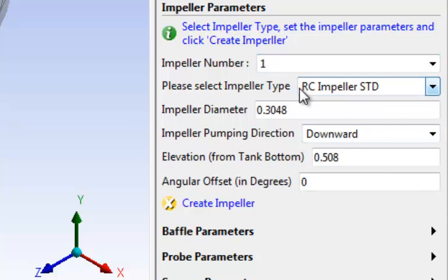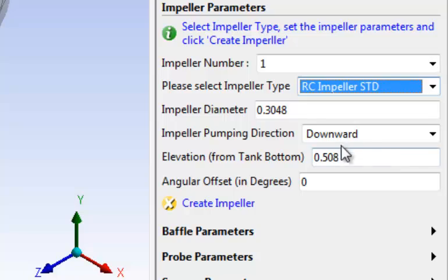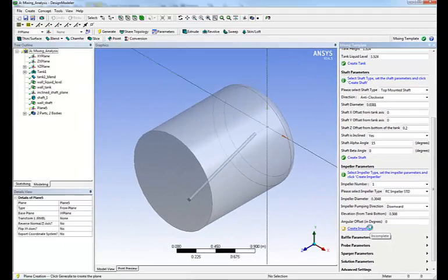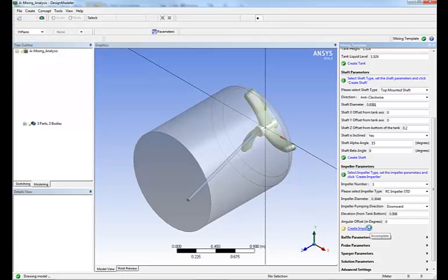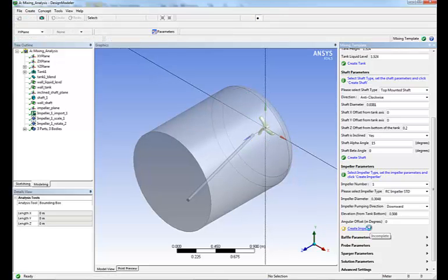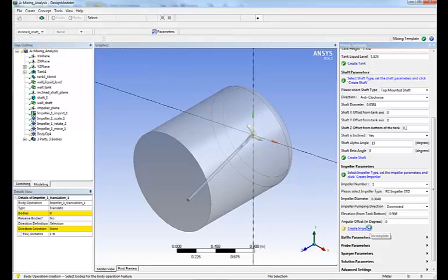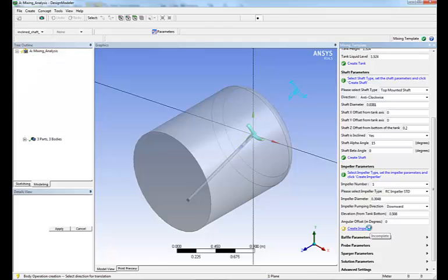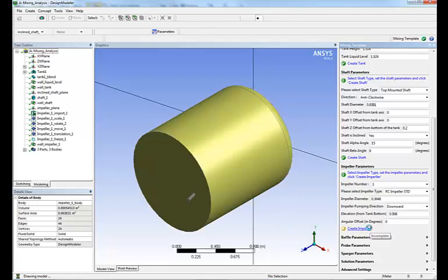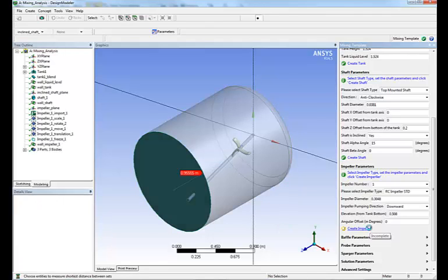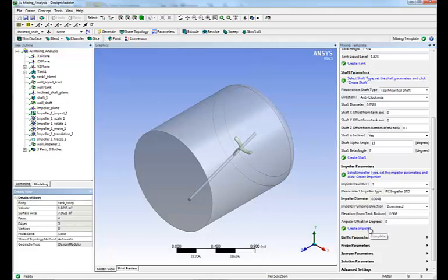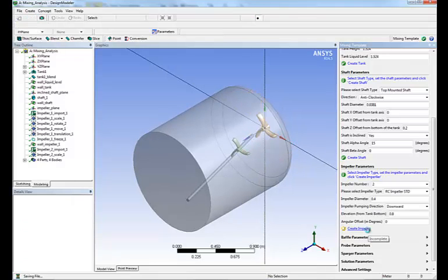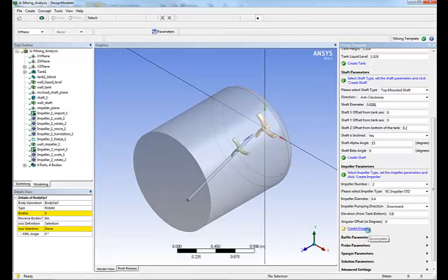Next step, we define the impellers. Different types of impellers exist. We enter the dimension and as before, we simply click create impeller and as you can see, the impeller is created automatically.